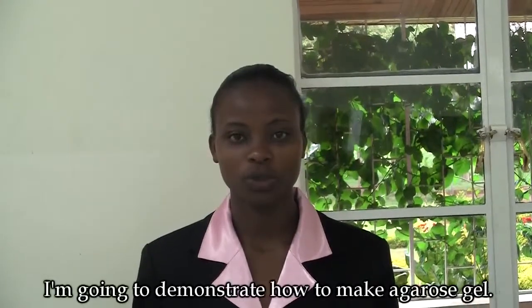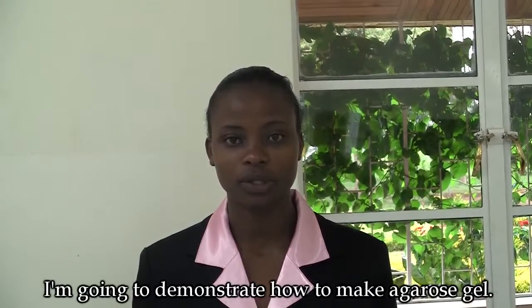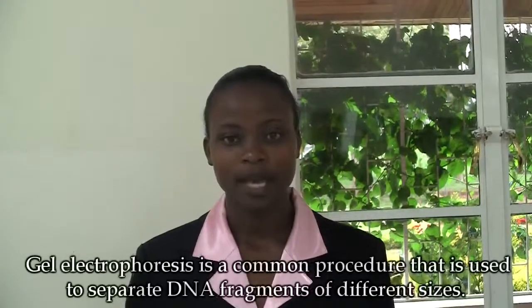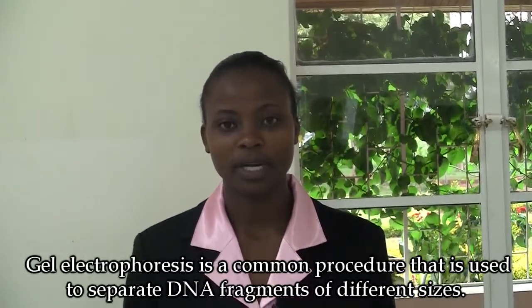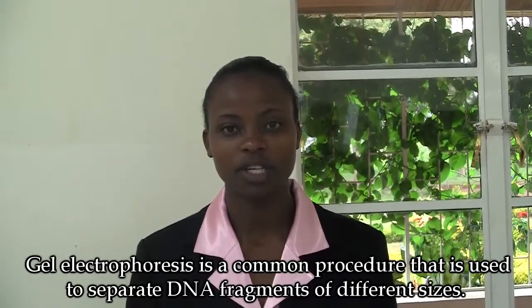I'm going to demonstrate to you how to make agarose gels. Gel electrophoresis is a common procedure that is used to separate DNA fragments of different sizes.